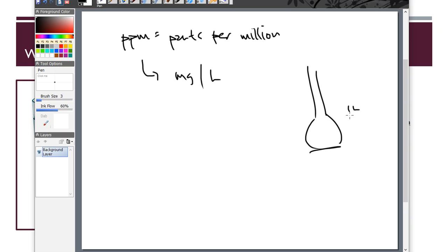So that amount of solution, that liter, I'm putting maybe a few little dabs into that liter of solution, and these could be measured in milligrams. If I know how many milligrams, maybe just a few specks, that I need in a liter of solution or solvent, then this is milligram per liter. And that milligram per liter is a concentration that we do like to report sometimes.